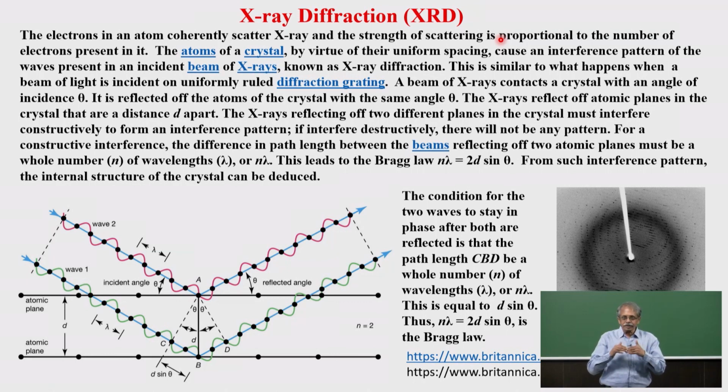Now, if you look at the crystal, the crystal has lattices, the lattice has atoms, and the atom has electrons. Now, if you make X radiation incident onto such a crystal, having such a lattice, having such an atom, having such electron density, that electron density reflects it. Now, this can happen from every atom, every plane, and the entire lattice. So, you have so many X radiation waves which are scattered by each center. Those waves would in turn get overlaid either in a constructive way or a destructive way.